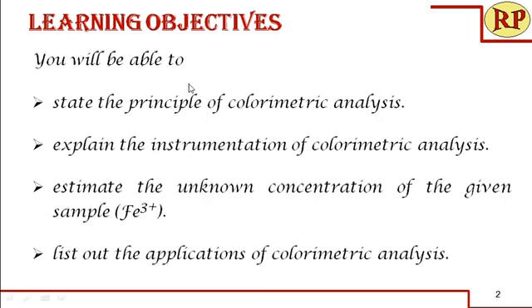At the end of the session, you'll be able to state the principle of colorimetric analysis, explain the instrumentation of colorimetric analysis, estimate the unknown concentration of a given sample, and also list out the applications of colorimetric analysis.